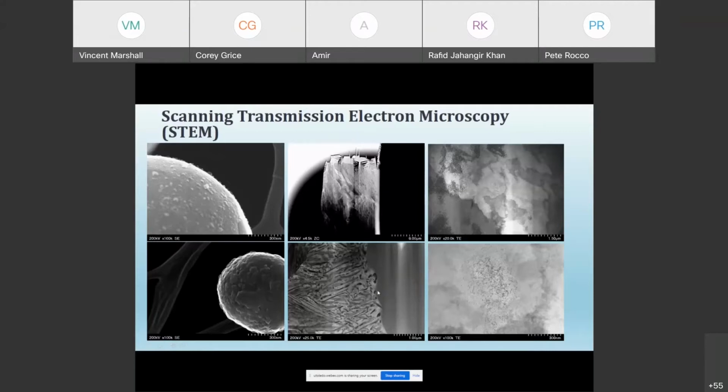And then right across the grain boundary, you've got regions where you've got phase segregation going on, and you can see the individual lamina of each of these phases being present, and you can analyze size, distribution, elemental information for those different features, as well as examining what's going on at the grain boundaries themselves. And you can even look at higher details.